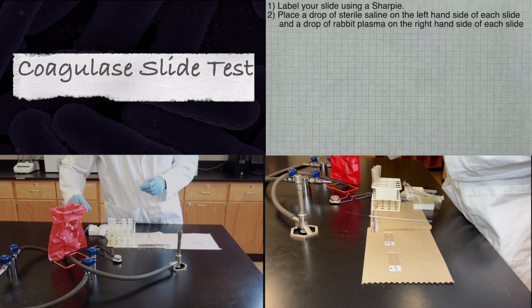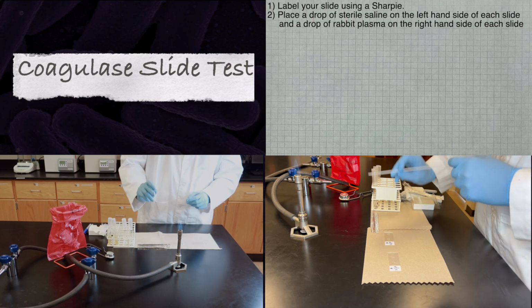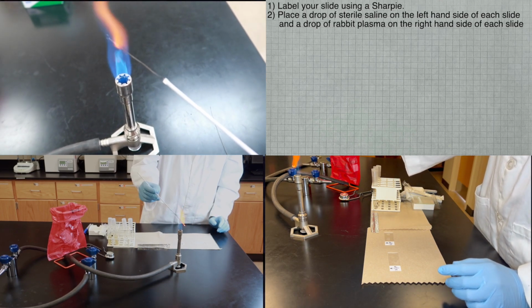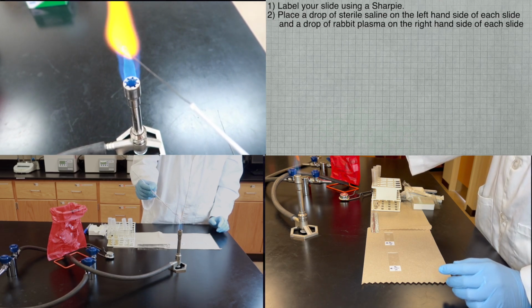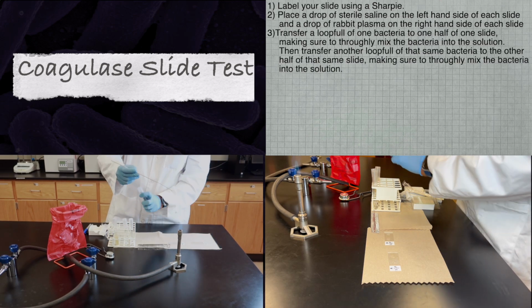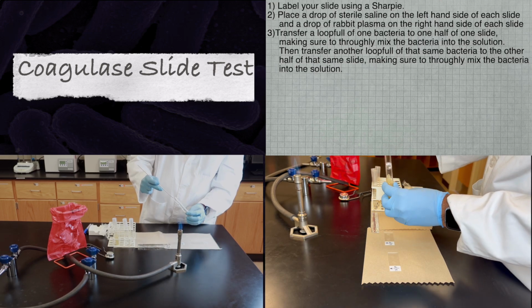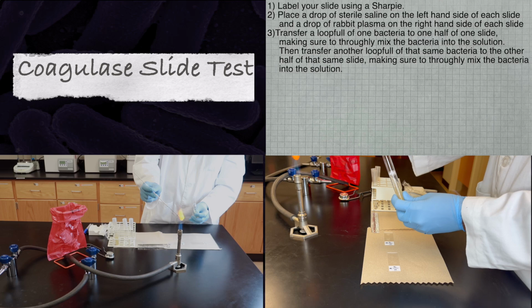Next, please follow aseptic technique to sterilize your inoculating loop, as you have previously learned in the class and as is being demonstrated here. Next, please transfer a loopful of one bacteria to 1/2 of one slide, making sure to thoroughly mix the bacteria into the solution.